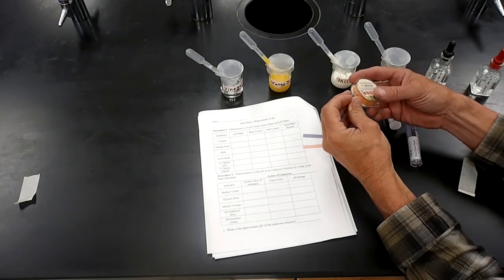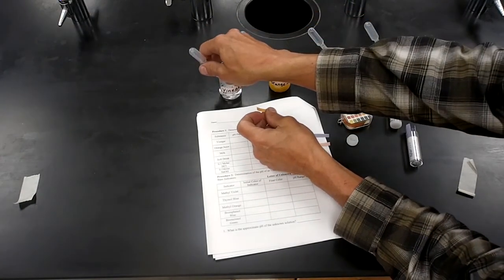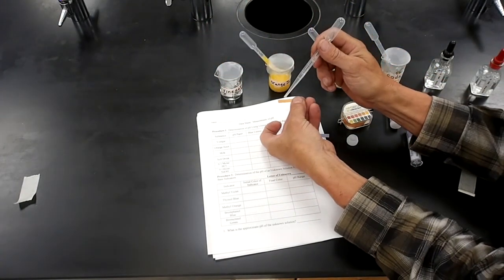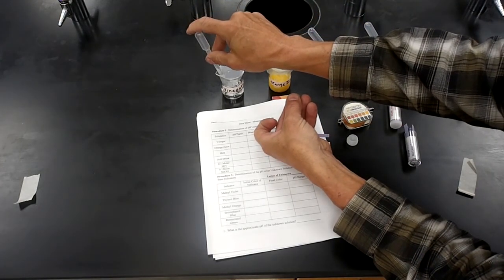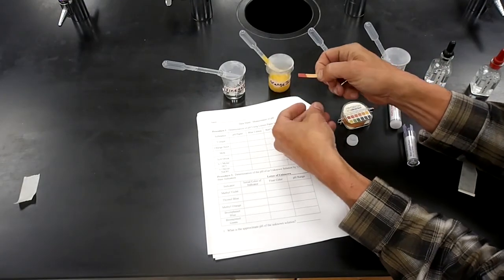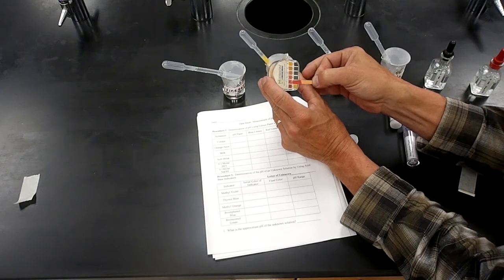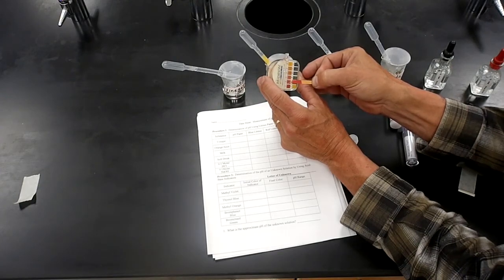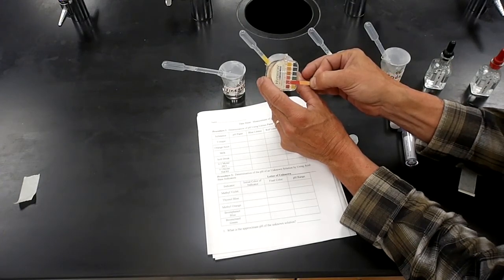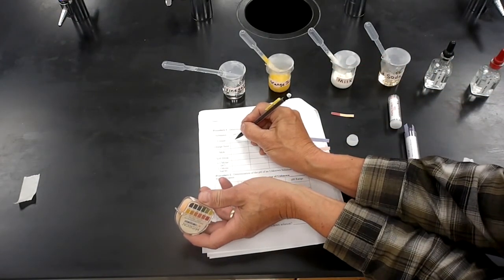So for the pH paper, we'll put our color here. So I'll take a little vinegar, put a little bit on this bit of pH paper. There it is. And you see you got a bit of a color change. Turns red. Don't know how good the color fidelity will be on the film, but I'm just going to compare it by eyeball. Anytime you're comparing something by eye, be aware, people interpret colors a little differently. So it's crude. I'm going to call out a pH of about 2. So on my data sheet, I'll just put a 2 here.